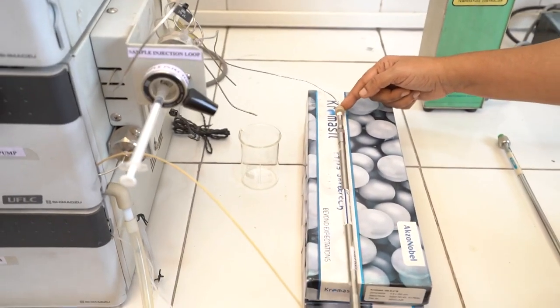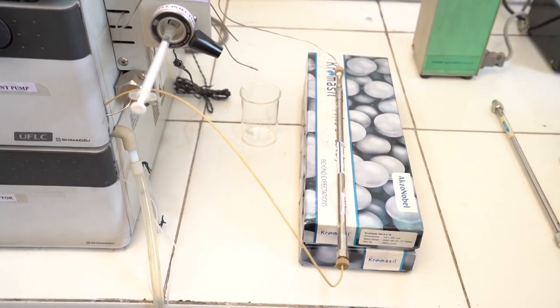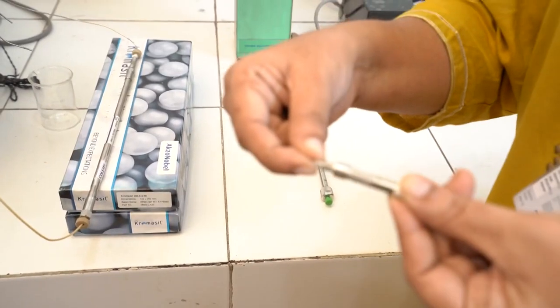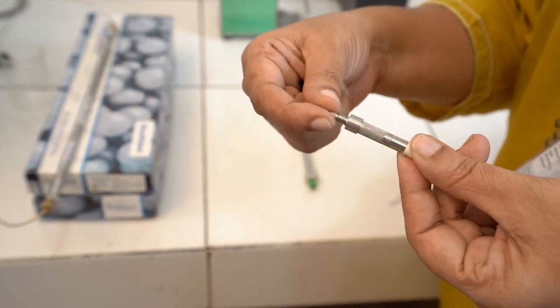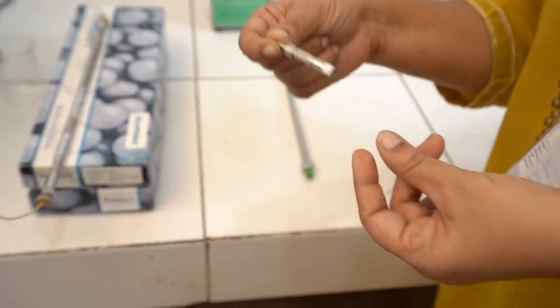This is the HPLC column. Columns in HPLC are of two types. We call it as the guard column, which is used in HPLC. This is a guard column which is used in HPLC. The guard column is placed before the analytical column. It is also called the pre-column, and it helps to protect the analytical column.